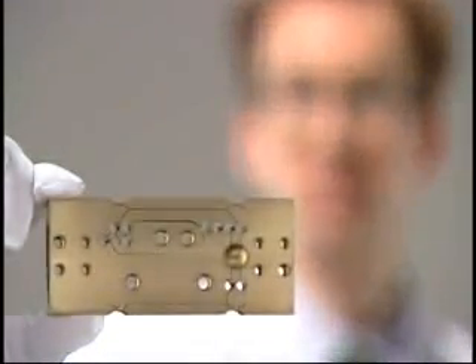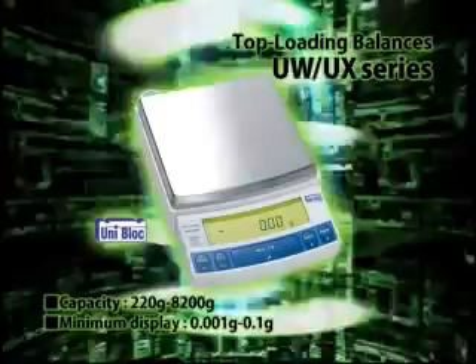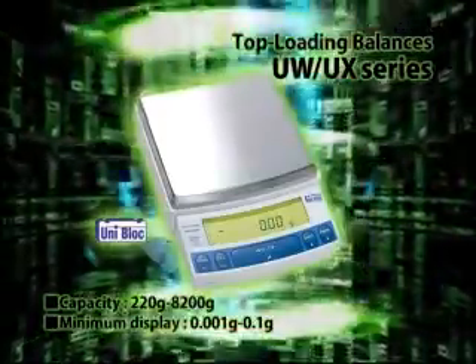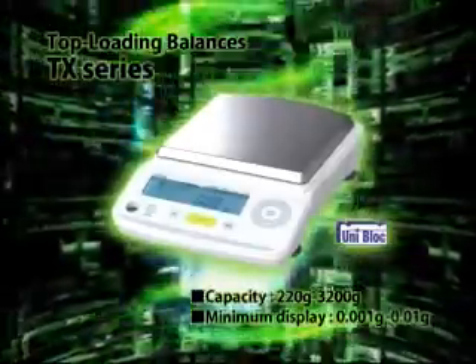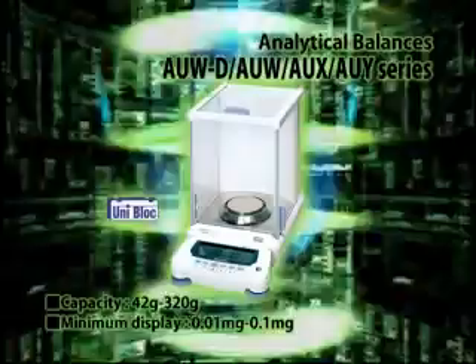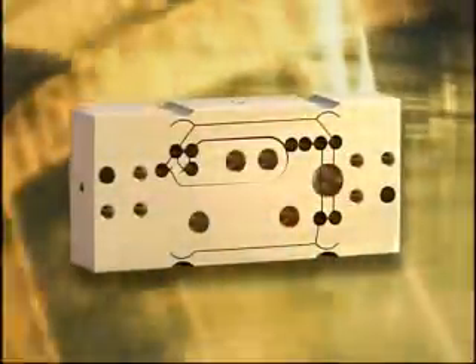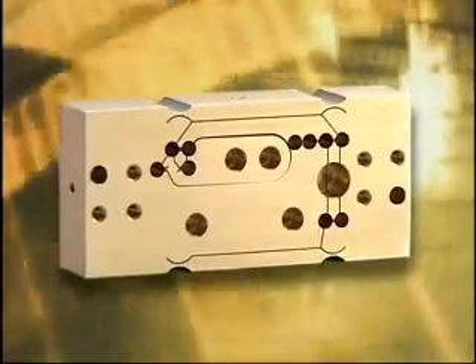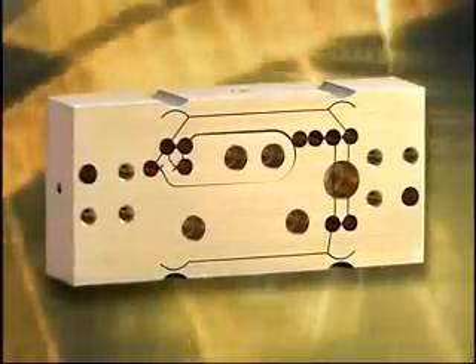Equipped with a wide range of features, the UX series is more convenient than ever to use. Even with a host of high-level functions, operation is still easy. TX series balances are a new advanced standard. The AU series semi-micro-analytical balance is the world's first to use UniBlock. Providing both durability and advanced performance, UniBlock is quickly spreading out all over the world.